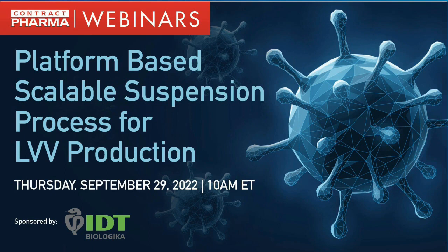Today's presentation will showcase IDT Biologika's platform-based approach for lentiviral vector production. Additionally, analytical methods for determining both the physical and functional titer will be described, which are used to assess the efficiency of lentiviral vector production.